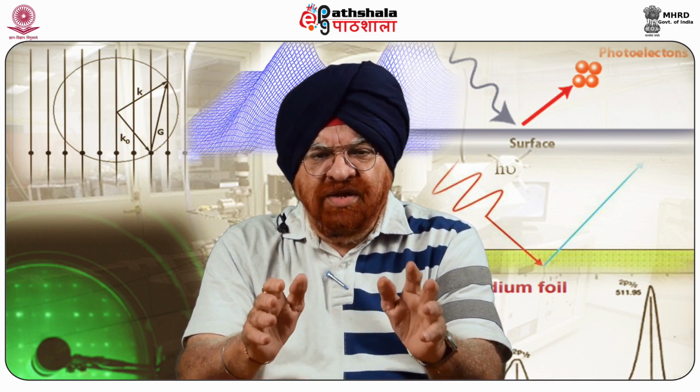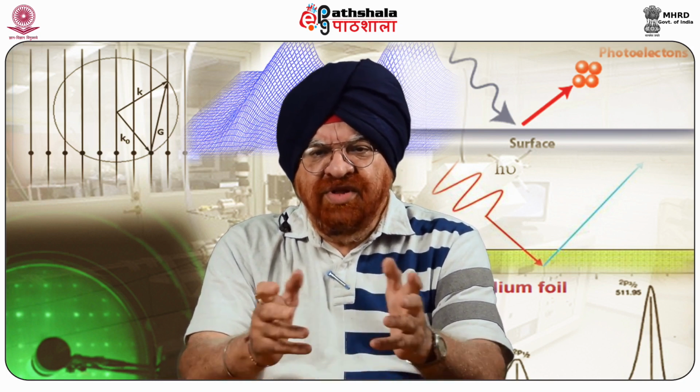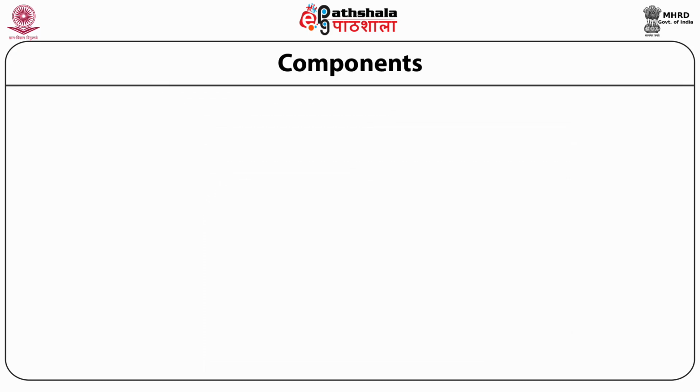A monochromator is an optical device that transmits a mechanically selectable narrow band of wavelength of light or other radiations chosen for this purpose from a wide range of wavelengths available at the input stage. This talks about the two important components of the spectrometer, that is lenses and analyzers.